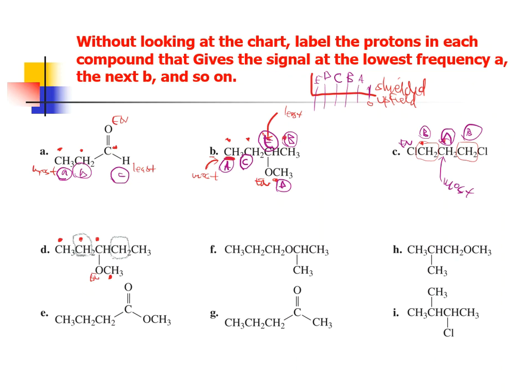Now, if I look on the other end of the molecule, the reason that I didn't ding-dong the right-hand one is because that's also equivalent. So that CH3 group is on a CH2 on a CH. This CH3 is on a CH2 on a CH. It is a symmetrical molecule from the middle. So everything to the left is identical to everything on the right. Okay? So 4 signals in total, and now we need to rank them.